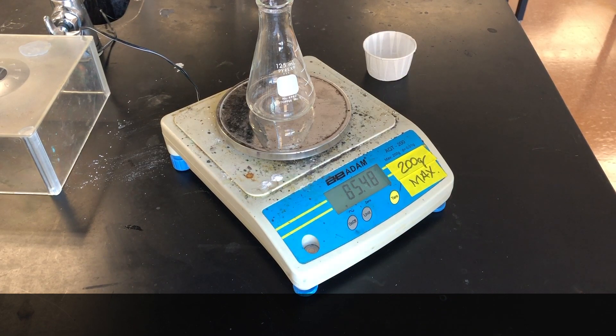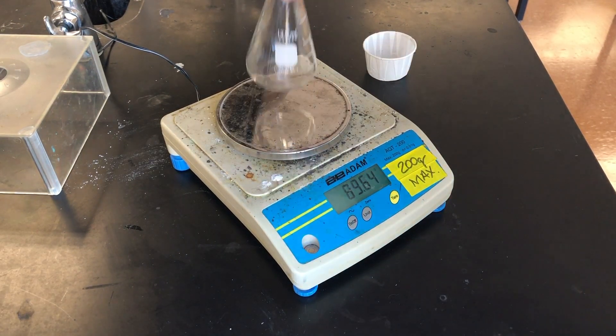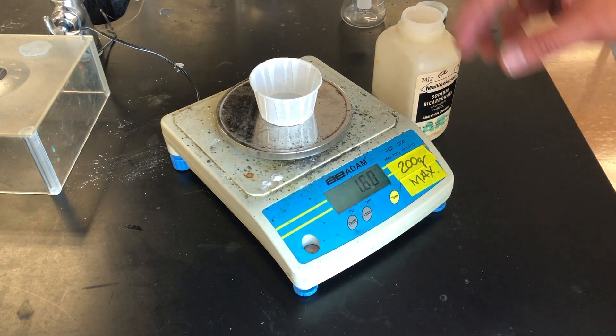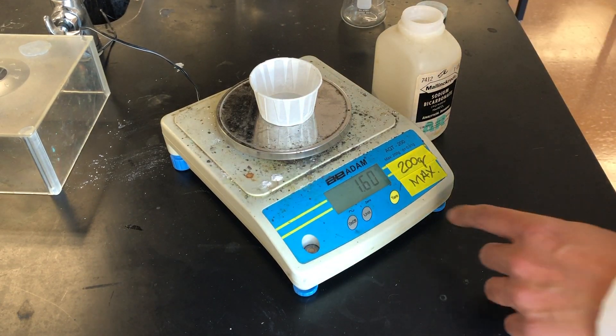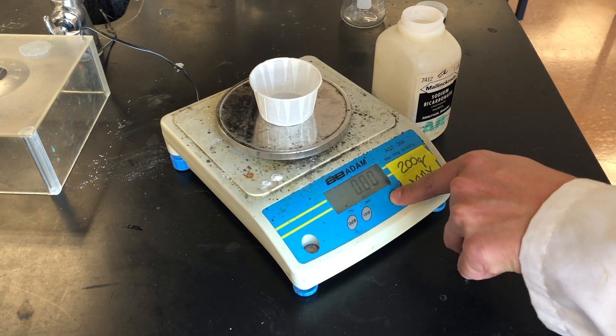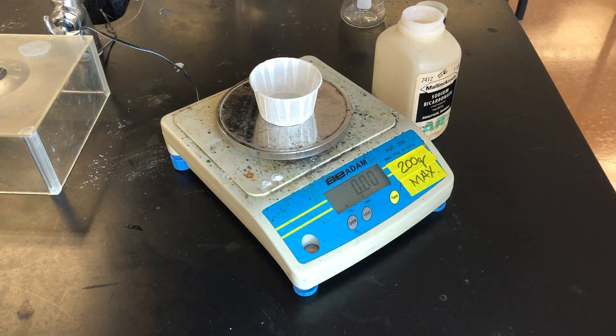We will note that in our data table. 85.48. Next reactant is the sodium bicarbonate. The sodium bicarbonate is a powder, so we'll need a little cup to measure it in. We will zero out the mass of the cup so that we only are calculating or measuring the mass of the powder that we put into the cup.